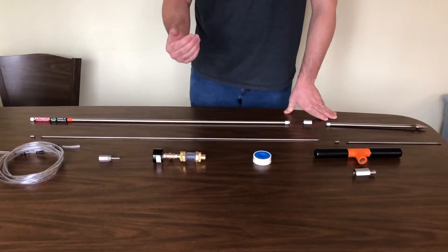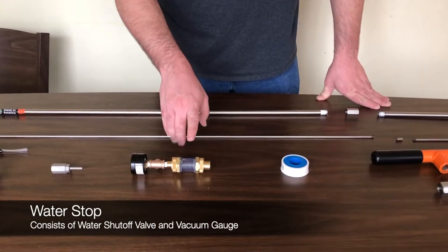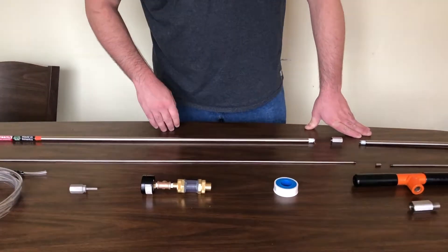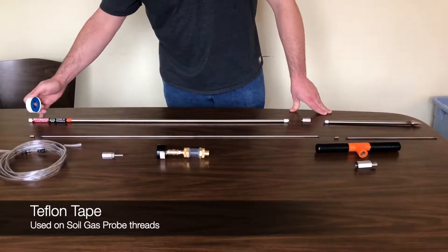Or if you believe groundwater may be an issue, we have an assembly that we call the water stop, which is made of a water shutoff valve and a vacuum gauge. We also have some Teflon tape, which should be used on each of the threads for the probe itself.